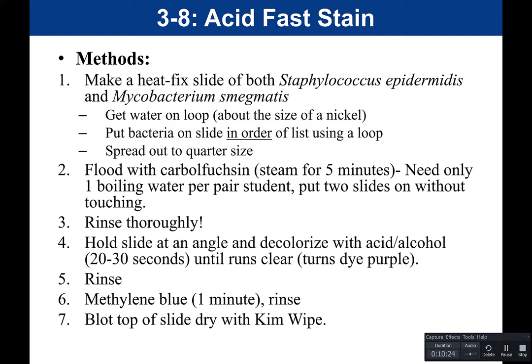After five minutes, dump the carbolfuchsin off and rinse thoroughly with deionized water — squirt the water above where the bacteria is and let it run down to remove any carbolfuchsin background. Then decolorize the slide. Just like the gram stain, hold the slide at an angle. Our decolorizer is acid-alcohol — add it to the top and let it run down. It will initially turn purple; that's expected. Continue until the liquid running off is clear — that takes about 20 to 30 seconds.